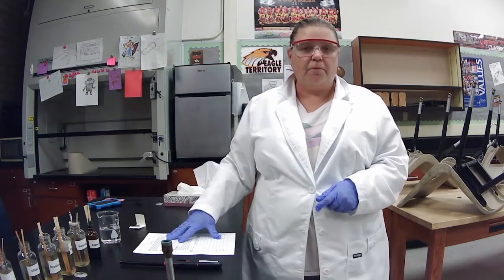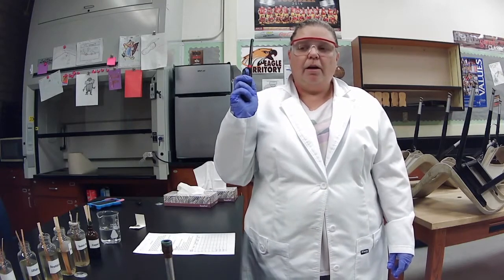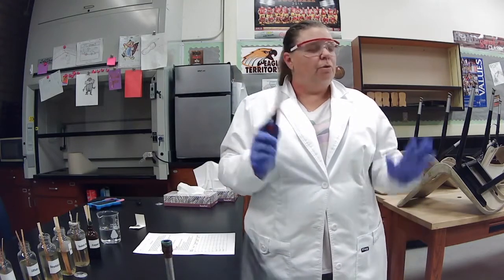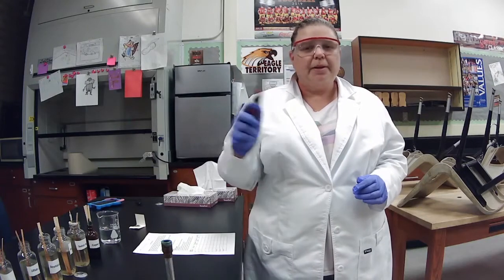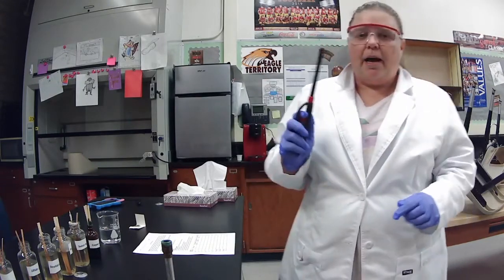The other thing that I'm going to do before I start is start my Bunsen burner. So how do we do that? The first thing we do is we light our lighter or match before we turn on the gas. We do not want to turn on the gas and release gas out in the classroom and then try to light a match. Not a good idea, okay? And I may have a little trouble doing this, and if my flame goes out before I light my Bunsen burner, I'll turn off my gas before I try again.